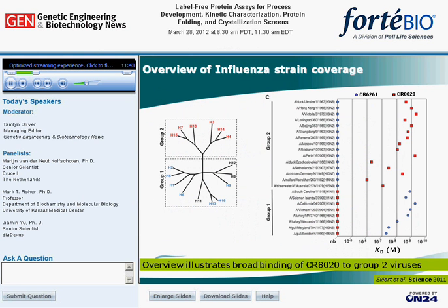An overview of binding specificities of 2 lead candidates was published last year in Science. Based on the dissociation equilibrium data, it's clear that antibody CR6261 has a preference for group 1 influenza and CR8020 for group 2 influenza.